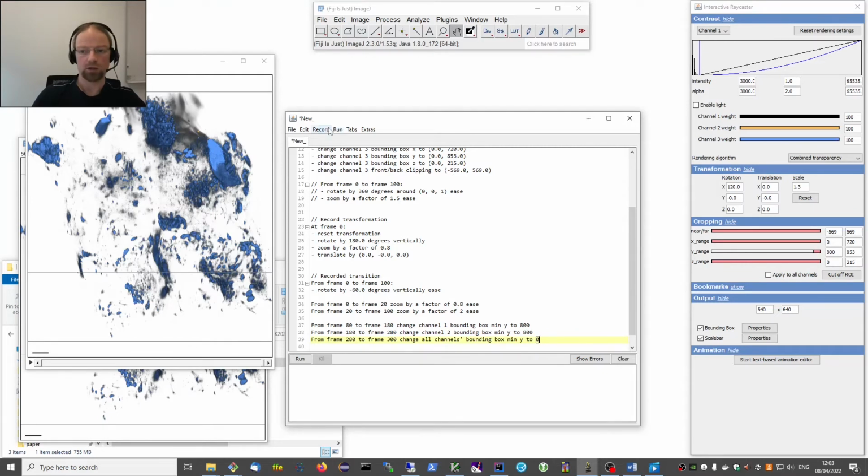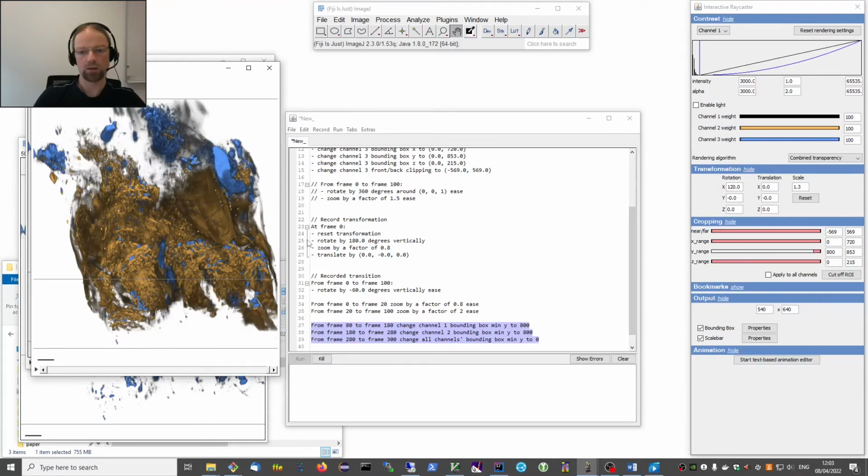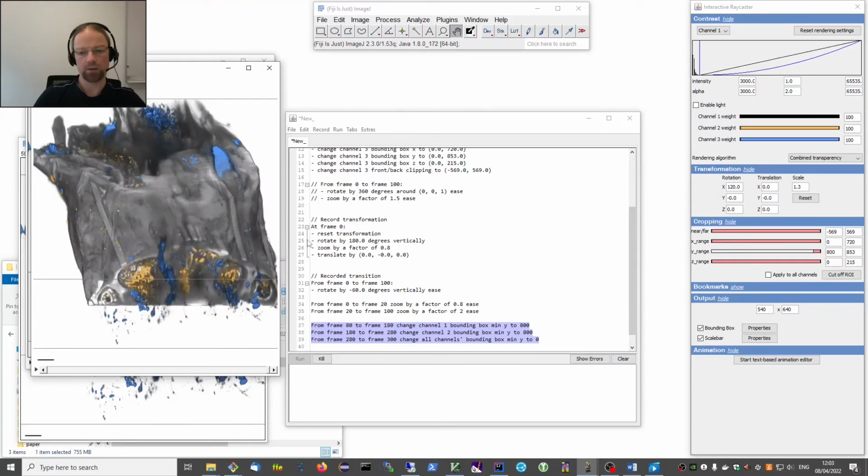And so again we could check with run from 2, but the shortcut for this is actually Control Shift R, so we can benefit from this. If you select some lines, it will automatically define the default frame that is rendered. So when I hit Control Shift R now, you can see it automatically sets it to 80 to 300. Again, it still takes the entire script into account, but only renders these frames. And so this is what we get. Again, we have the cropping away. First channel 1, then channel 2, and then they come back.